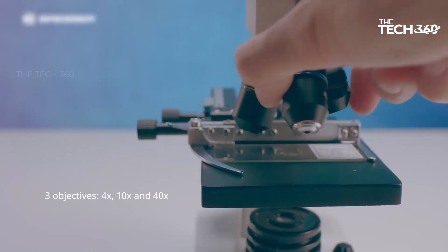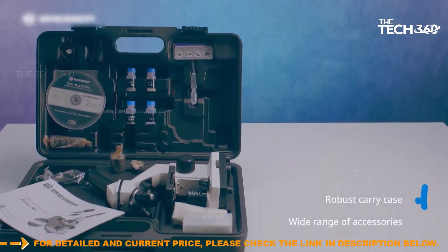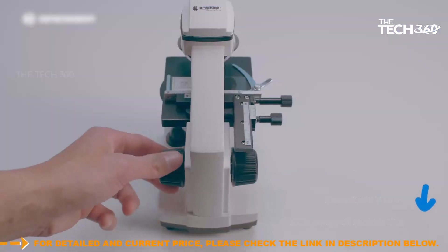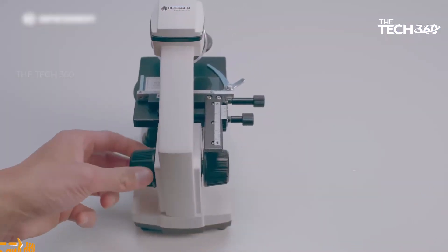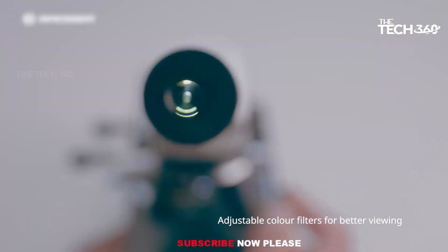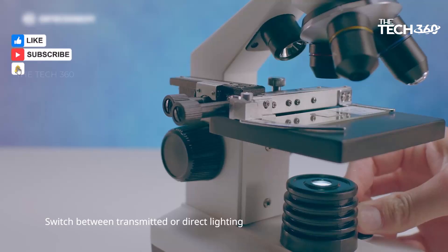The power is supplied by batteries, 3X AA. A dust cover, 5 prepared slides and 5 blank slides with coverslips are included for making your own samples. With the included HD camera you can observe your samples on the computer screen and capture images and video with the included Windows software.